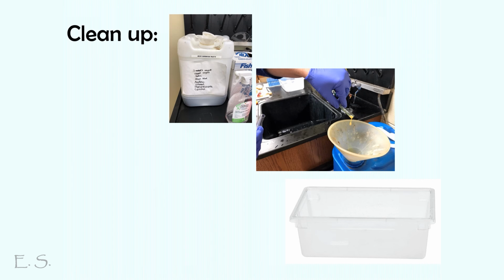For cleanup, please dispose contents of test tubes in the designated carboy, normally by the sink. Then place the empty tubes in the plastic bin that should have soapy water.